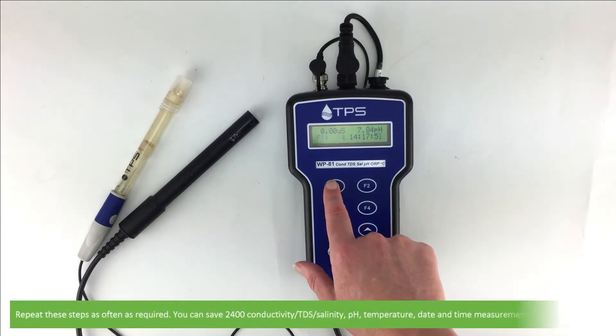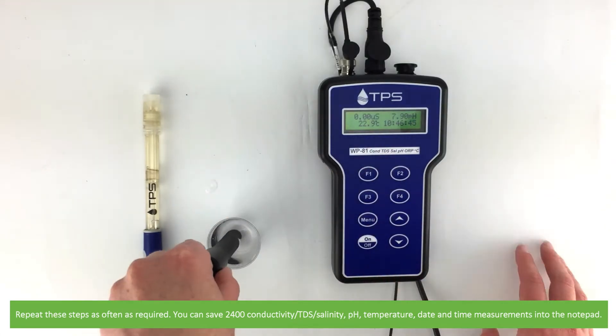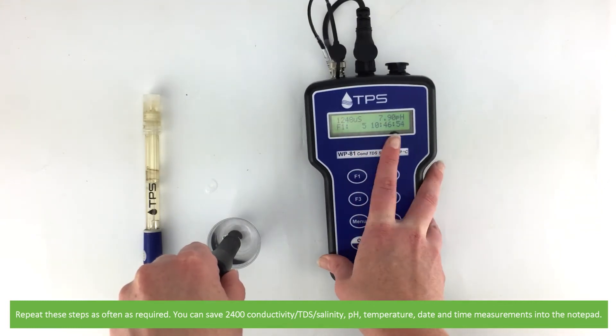You can repeat these steps as often as required. You can save 2400 conductivity, TDS, salinity, pH, temperature, date and time measurements into the notepad.